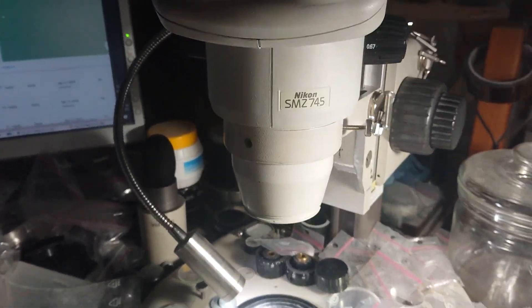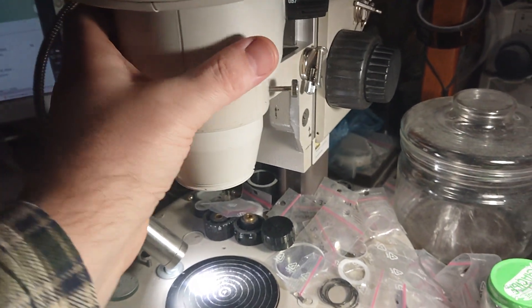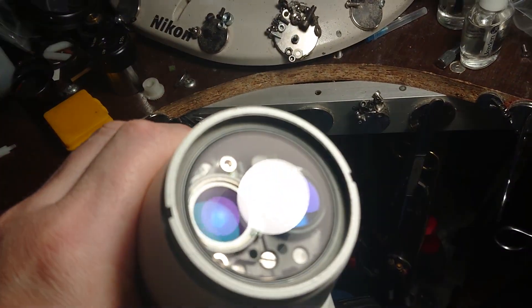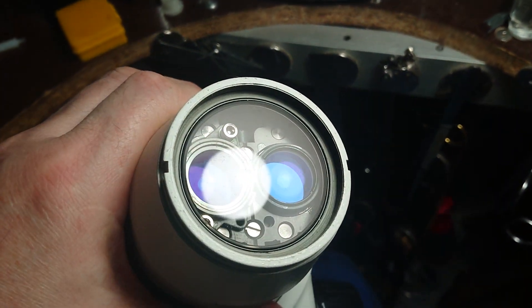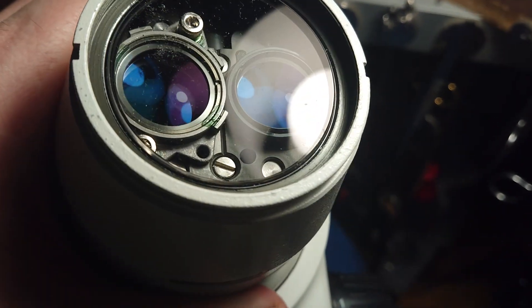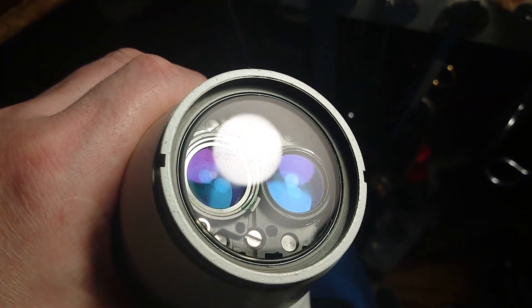So we can see some loss of alignment here. We can also compare the coating on the protective glass versus the coating on the lenses. The lens coating is a pretty green or slightly violet color, but the protective glass is shining bright — which indicates it's not a properly coated glass.